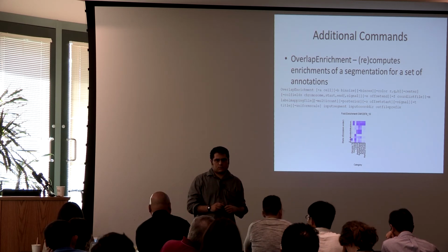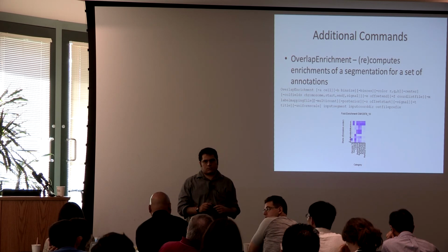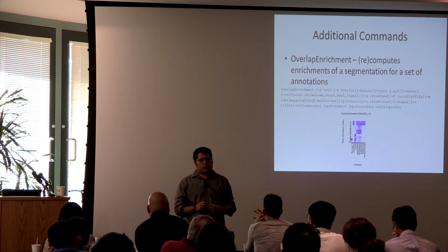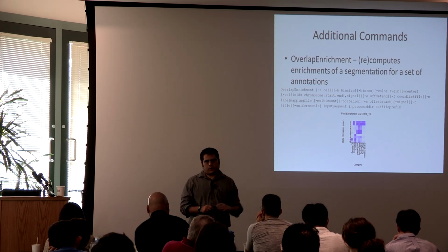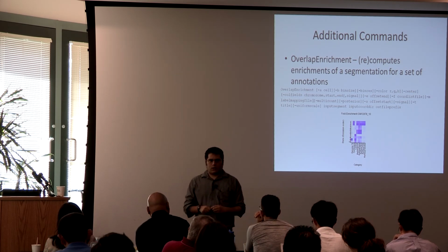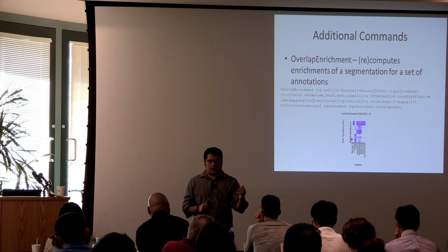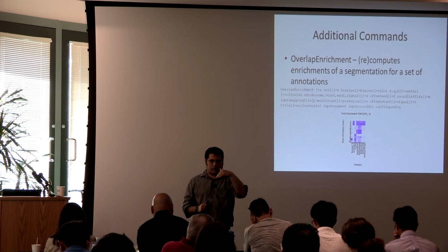Has anyone begun to incorporate the histone marks into network analysis? Yeah, I didn't get into this, but by analyzing the places where you have the enhancers, you can search for regulatory motifs, and that can implicate transcription factors targeting the enhancer. So that's upstream of the enhancer.